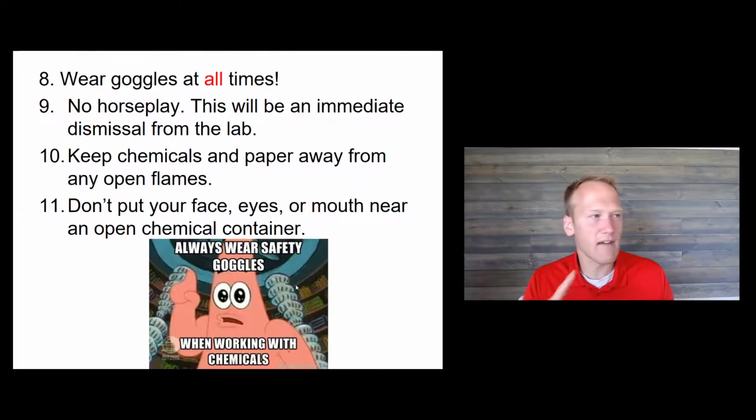Usually what I say is everything is hot, everything is dangerous. If you work with the premise that everything is hot and everything is dangerous, it will help you with the mindset of caution as we proceed through this.